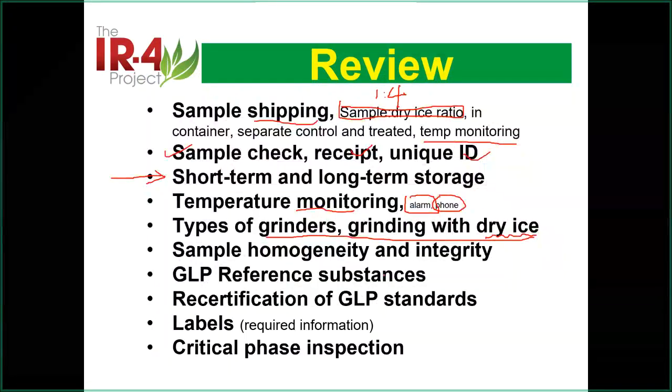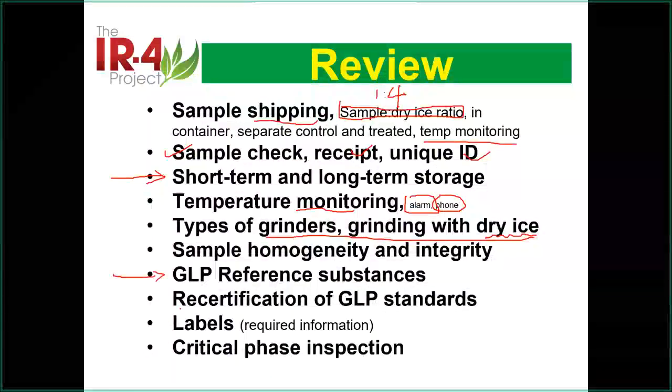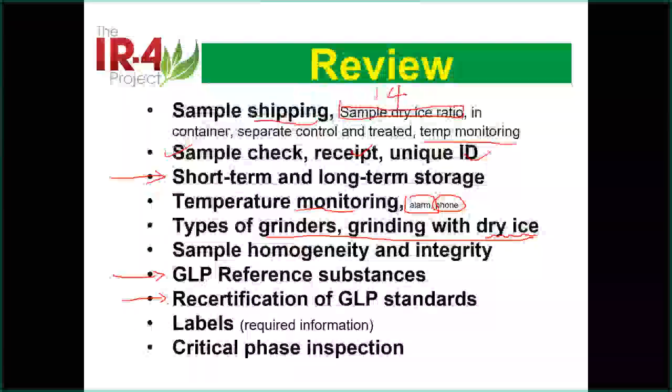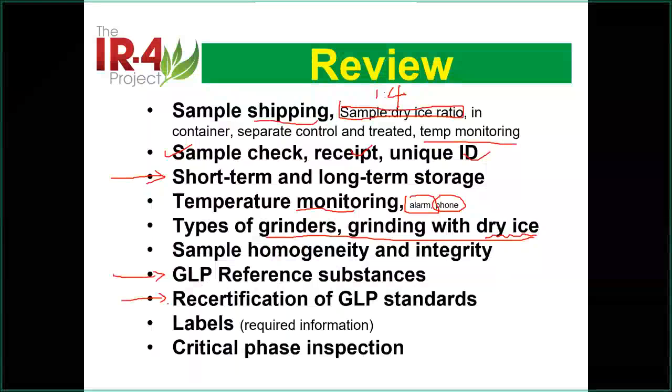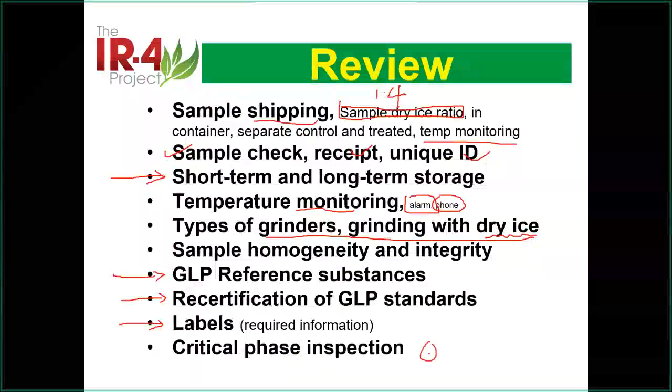We talk about the standards and the recertification for that standard. For example, we received some standard, then later it's expired, but they don't send you the standard again. They send you another certificate. Okay, we talked about a lot of requirements which should be on the label. Okay, and we talked about the QA form. This one is a QA form, which is the in-life inspection.